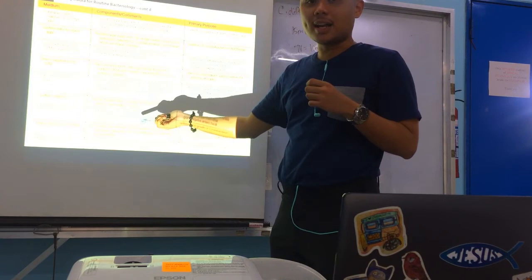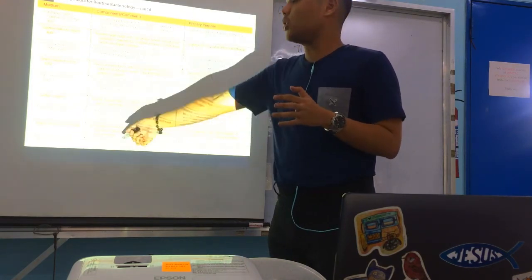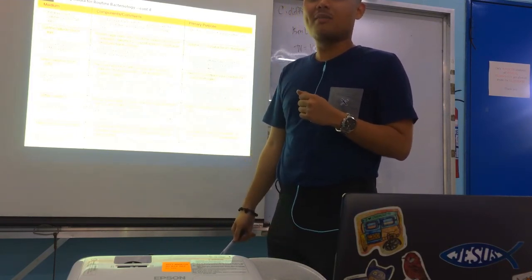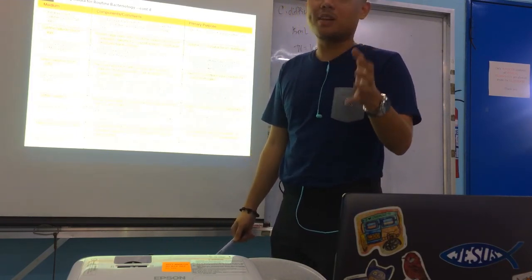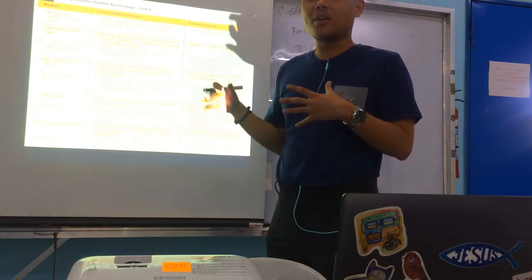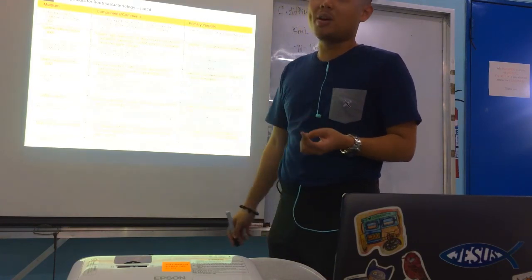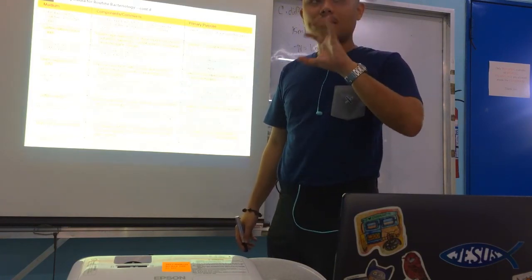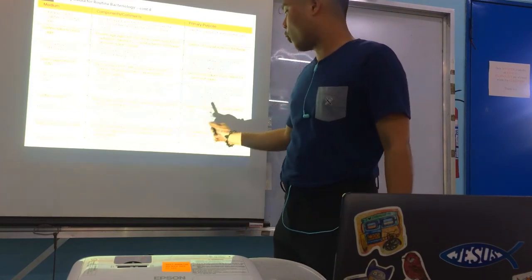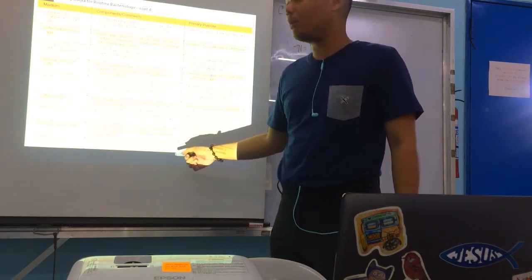Alright. MacConkey agar, and MacConkey sorbitol. Please do not get confused with these two. Sorbitol MacConkey is specifically for the isolation of E. coli O157:H7, which is a serotype of E. coli, also known as enterohemorrhagic E. coli. Other serotypes of E. coli are sorbitol fermenters, except for E. coli O157:H7. So other E. coli serotypes on sorbitol MacConkey are pink colonies, but O157:H7 is colorless, because it is a non-fermenter of sorbitol.